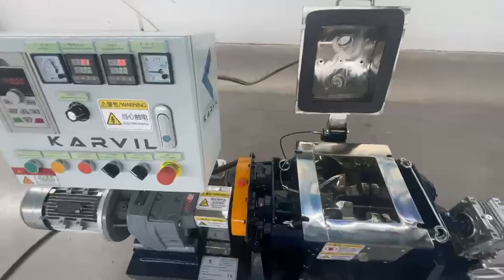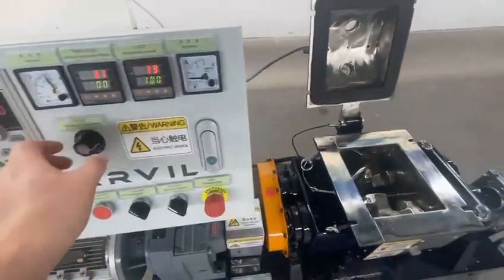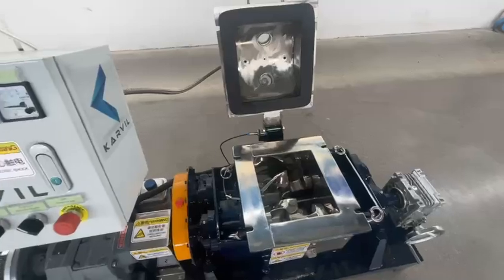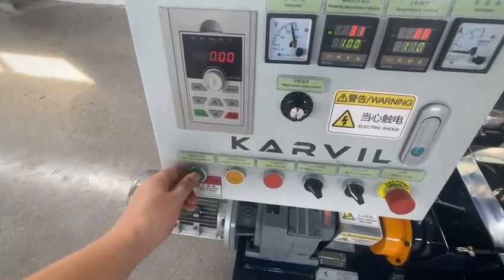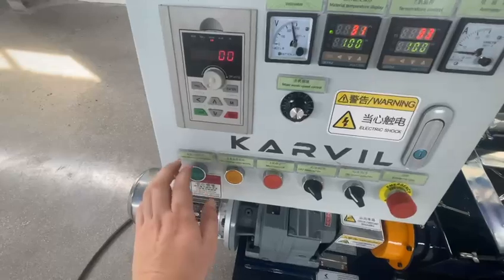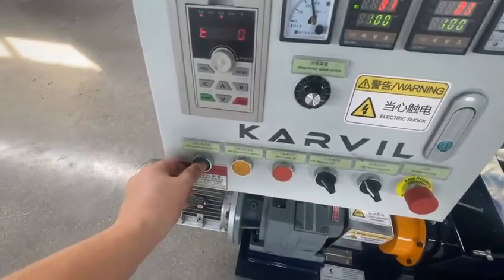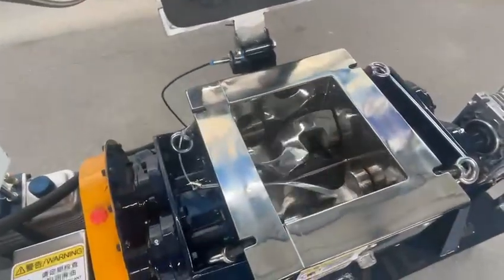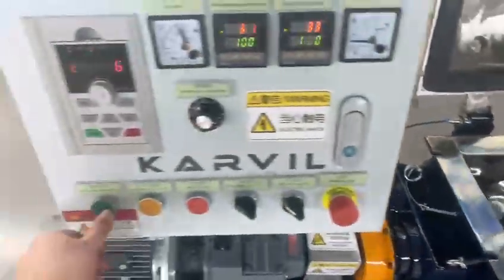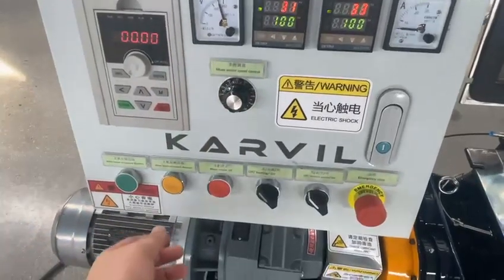Even in this position with the lid open, the blades can also be driven. However, we must keep a hand on the button — mixing forward or mixing reverse. Keep my hand on the button. It works. We can also adjust the speed.